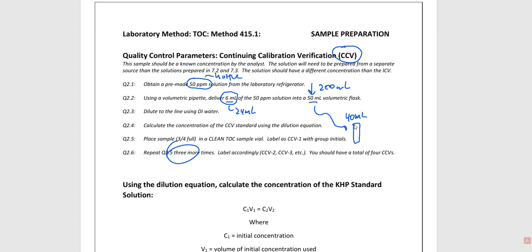We've got a 20 mil volumetric and we've got a 4 mil volumetric, but by the time that you use multiple volumetric pipettes this way, you're opening yourself up to more error. So we just don't like that when that begins to happen. But I think that for practice purposes, making you do this 4 separate times is going to be in your favor in the long run.